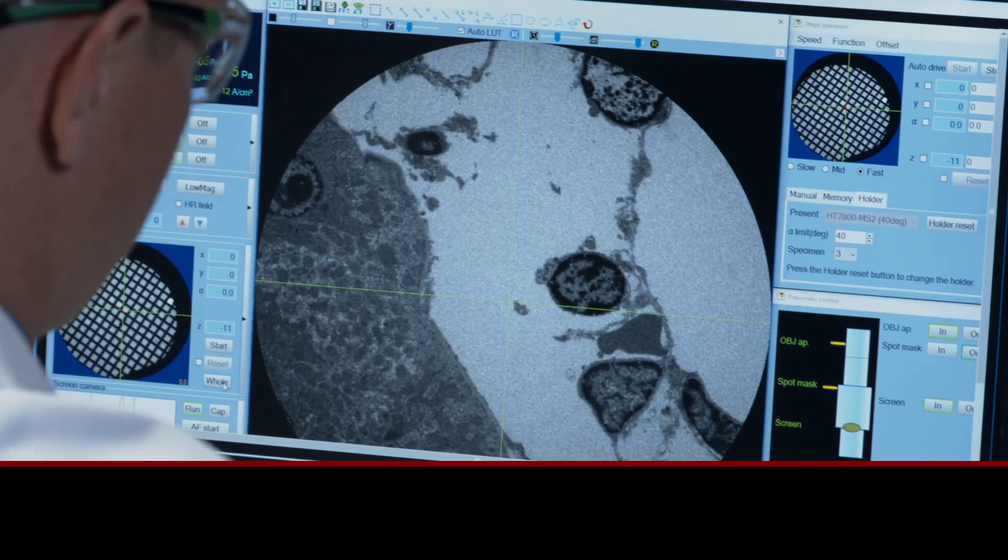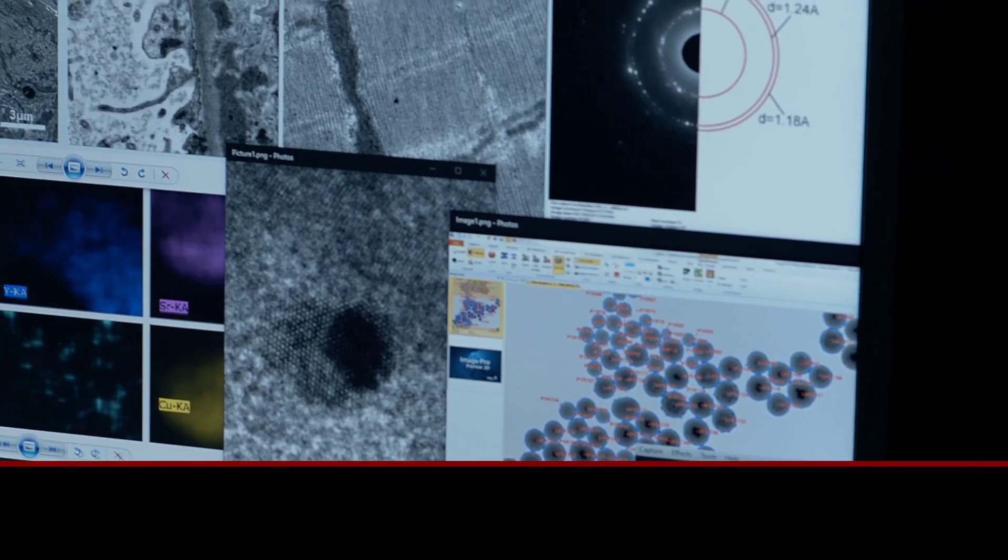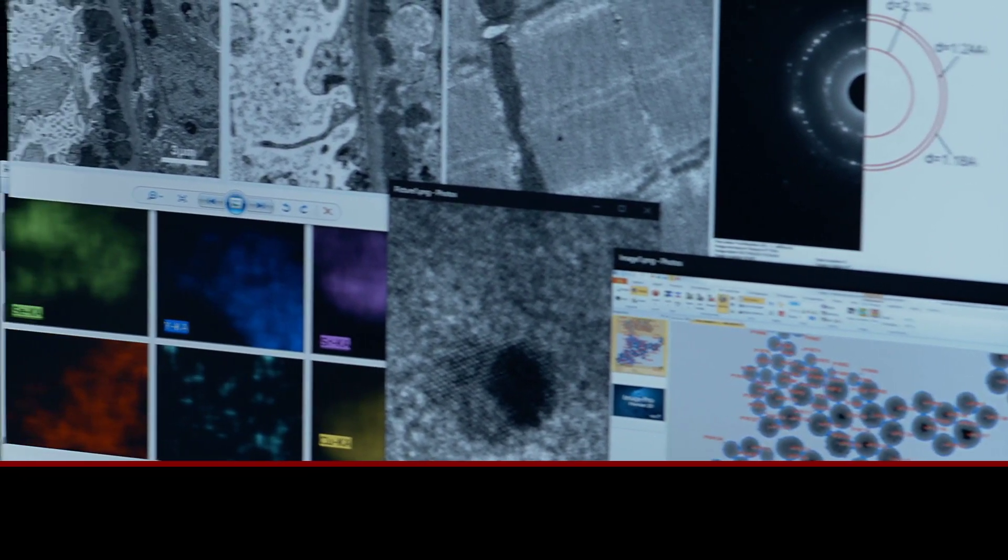Designed with intuitive logic, the instrument architecture and new user interface provide comprehensive digital imaging, automation, and analysis.